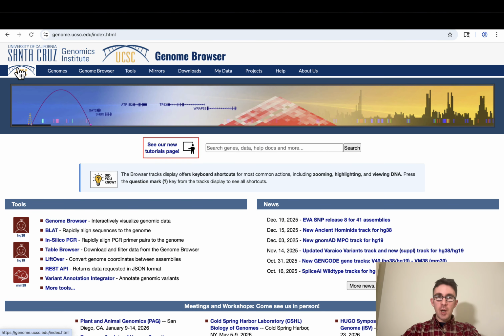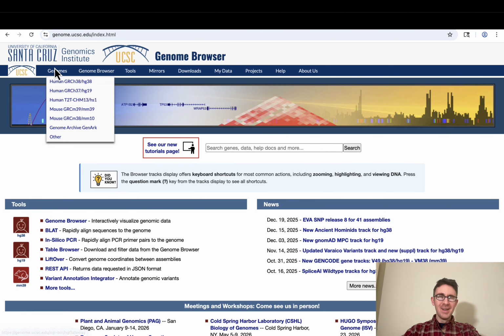Sorry guys, I had to cut because the website actually just froze up on me. Whatever, it's a cool free web resource, so I don't want to complain about performance or whatever. It still is super cool. But yeah, it did just freeze up just now.